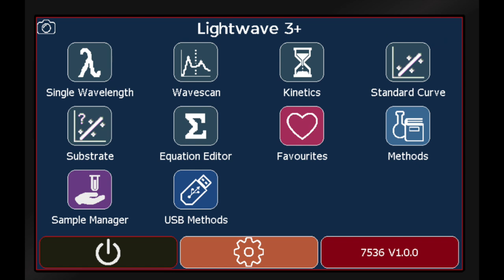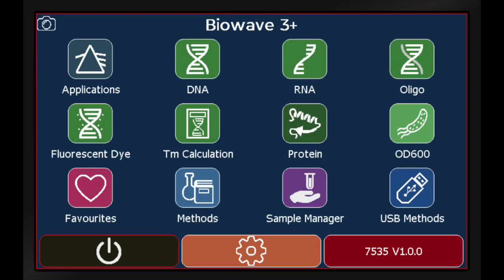All of the units have scanning, kinetics, and powerful onboard method building and analysis capabilities. The BioWave units also have preloaded methods for all common biological applications.